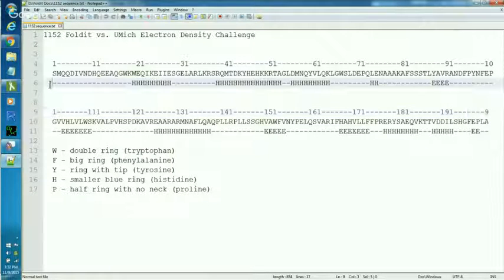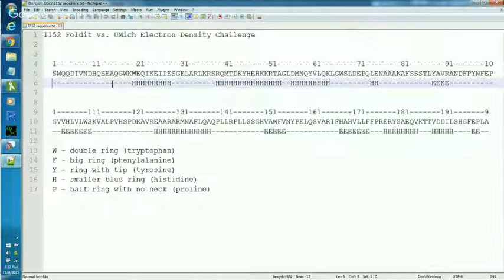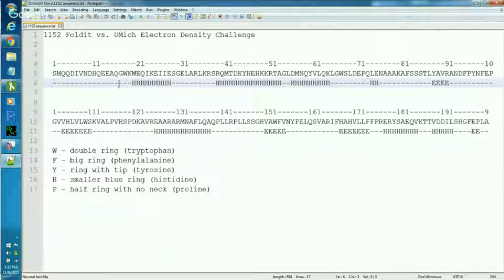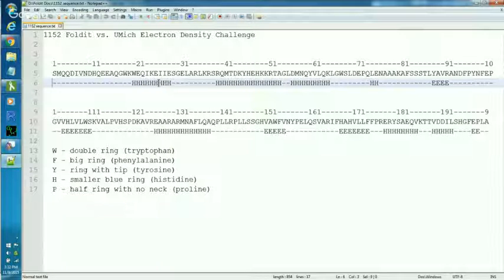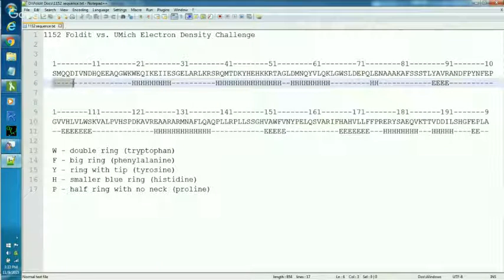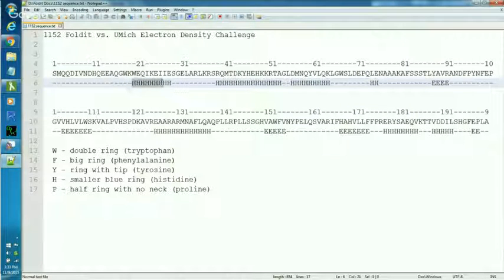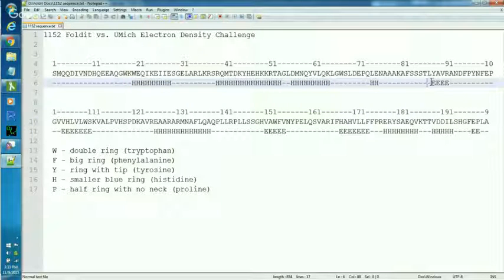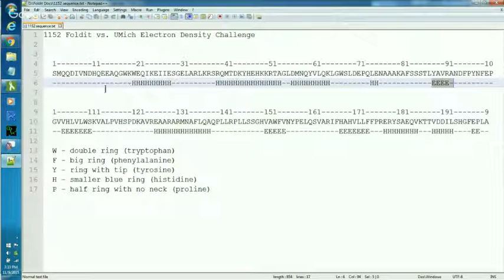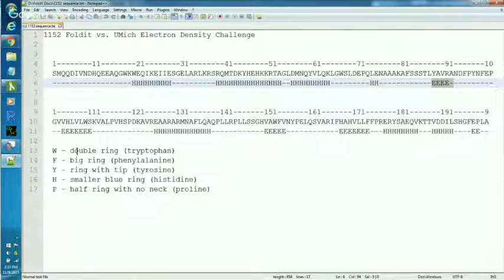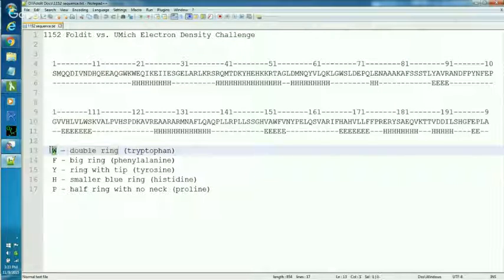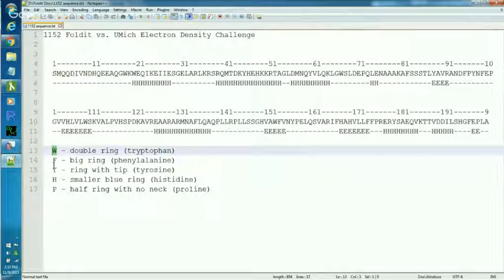Then below the sequence, I typed in the secondary structure that was predicted on the protein. When we were given the protein, it had helixes and sheets already predicted on it. These dashes are loops, the H's are helix segments, and the E's are sheets. And again, I got those off the protein in the puzzle. Then I made some notes down at the bottom about the kind of side chains that I'm looking for as landmarks. The double ring side chain is abbreviated with a W. And I got these letters off of the wiki.